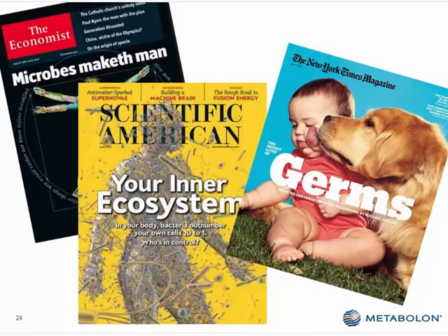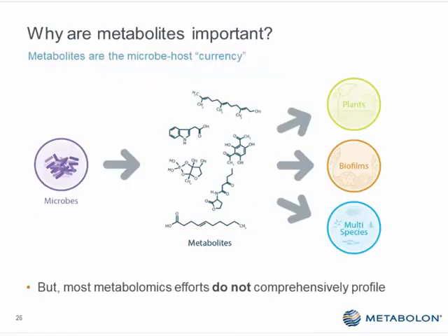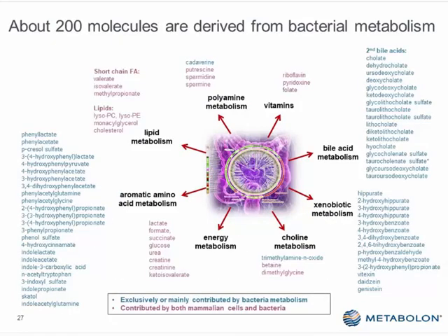Just a little bit about the microbiome. Of course, there's a lot now in the peer-reviewed publications, and also in the general news, about the importance of your microbiome. From our perspective, one of the big findings over the last 3 or 4 years is that there are just so many biochemicals that we measure in blood, upwards of 200 that we routinely measure in every blood sample, that are just coming from bacteria or from your gut metabolism. So we often get the question, how do we know that? How do we know these are just coming from bacterial metabolism?